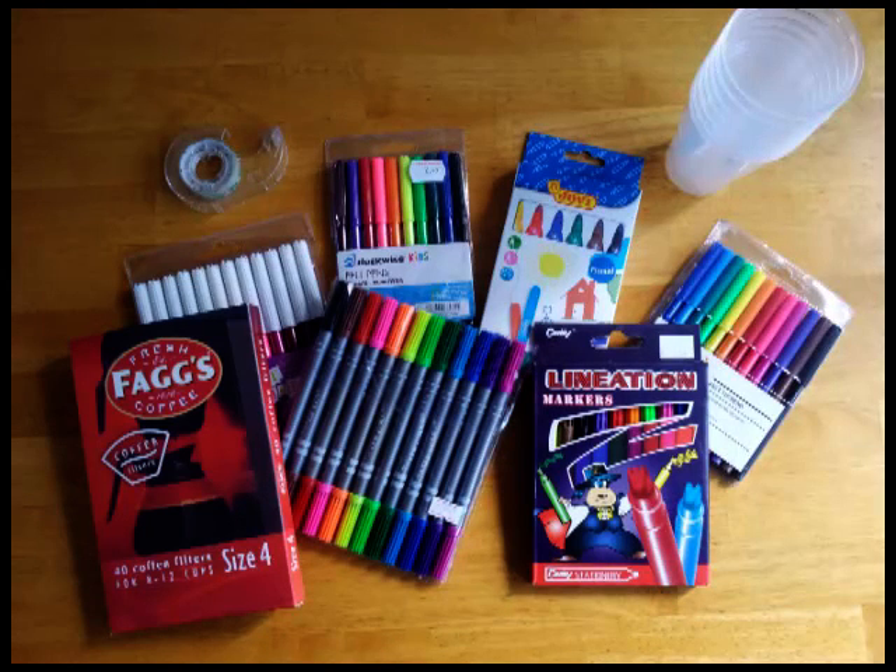This is part two of a series of experiments on solubility. In this experiment we're actually going to be carrying out a technique called chromatography. You probably don't even need to tell the students that, but it's an experiment to do with felt tip pens and we're going to look at the solubility of different inks.